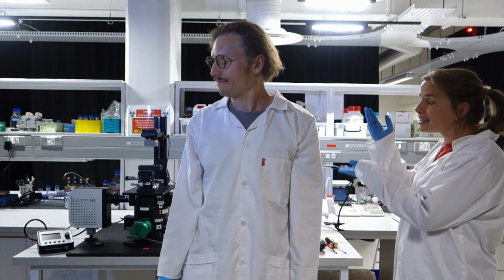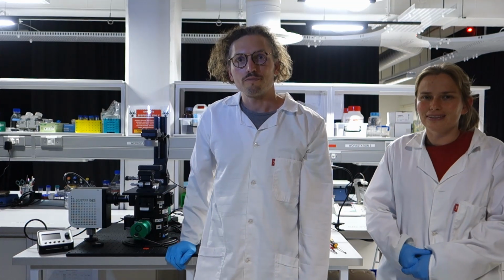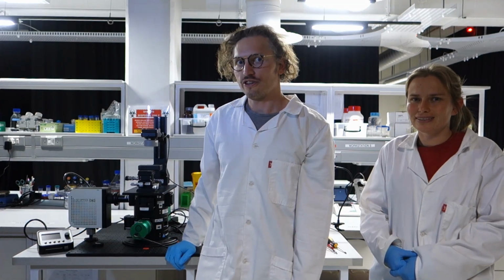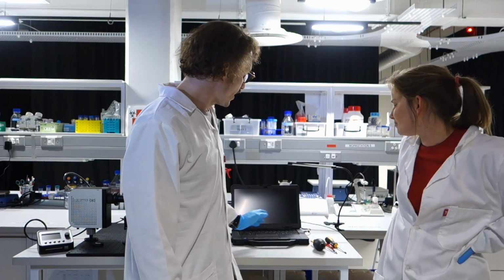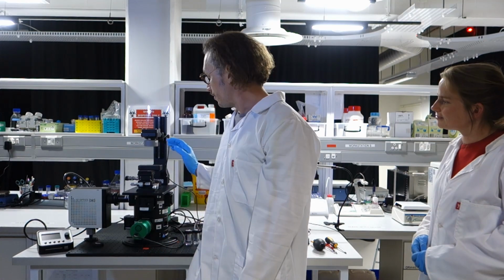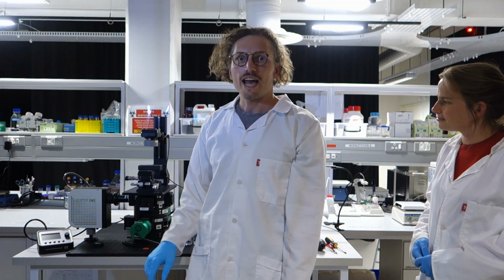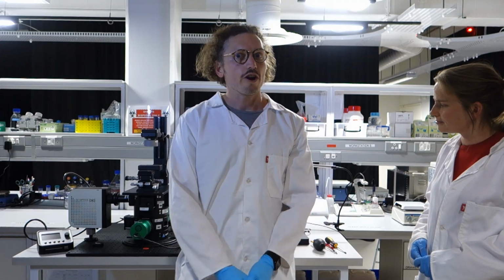Now that we've successfully assembled the openScope Traveller, we are going to go through Brightfield imaging as an imaging modality in today's session. So we are going to cover starting up the laptop, popping your first sample onto the openScope Traveller, and being able to capture your first image in Brightfield mode. We hope that you find this video useful.